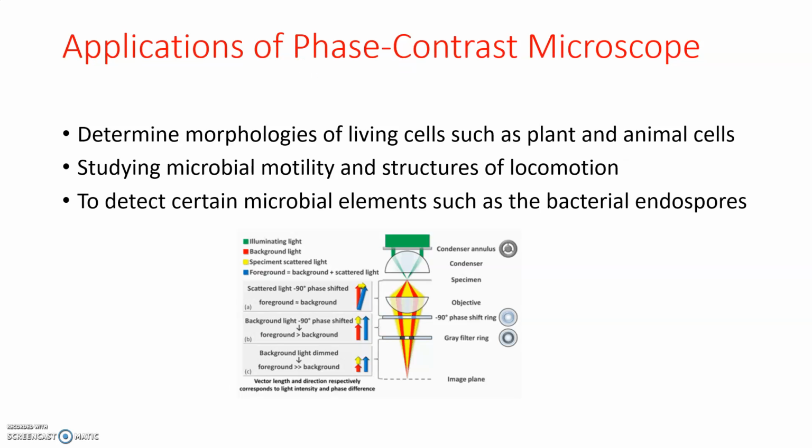So in the next class, we will discuss the dark field microscope. So these are all about the phase contrast microscope. Thank you all.